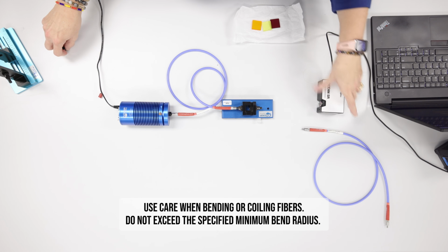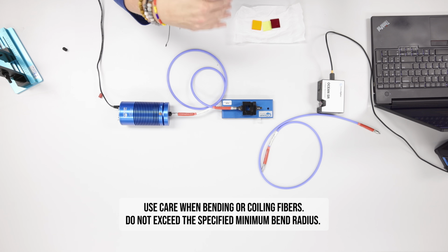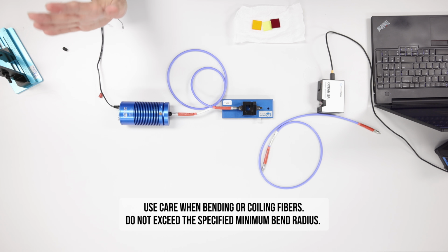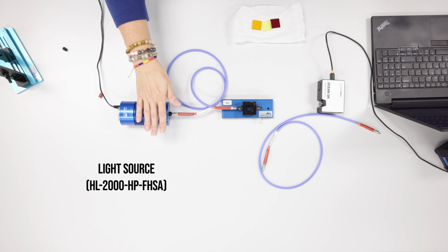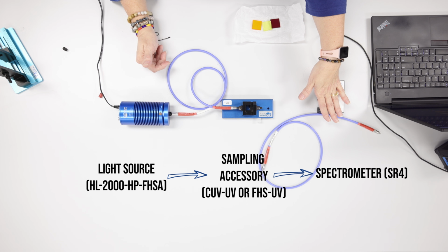So very similar setup. Because we're sending light directly to the spectrometer, I do go with a smaller slit on those, although having this adjuster helps a lot. So if someone wants to stick with a larger slit so they can use it for different purposes, different applications, then some type of attenuator will help them to manage the potential saturation.